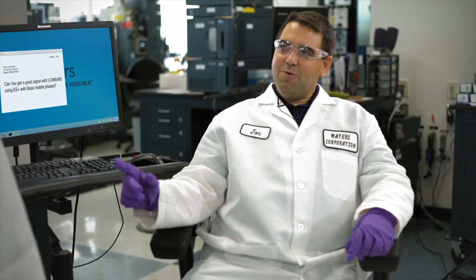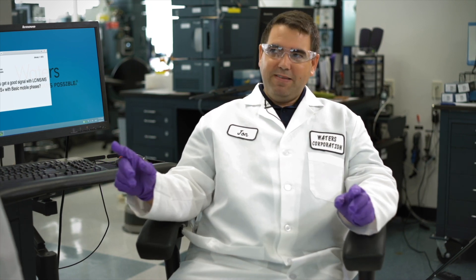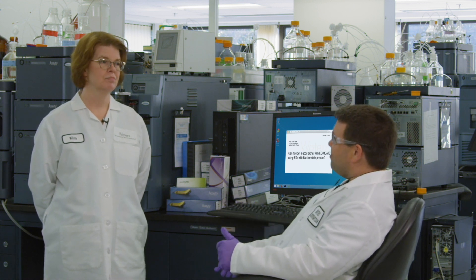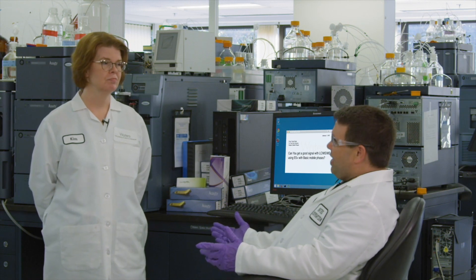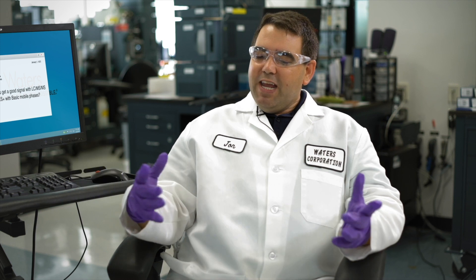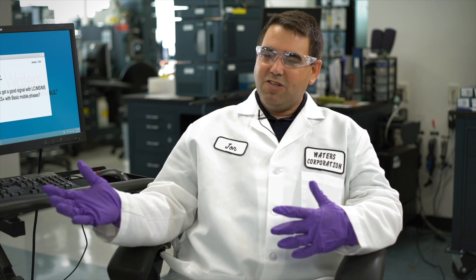Based on the experiments we ran with basic analytes under both acidic and basic mobile phase conditions in electrospray positive mode, it's pretty convincing that you can get a really good signal — if not a better signal — when using a basic additive in your mobile phase. This myth is busted. A lot of people might not screen with the basic additive just because they may not have a column that can handle the alkaline mobile phase, but if you really want to screen your MS sensitivity, you should be screening under both acidic and basic conditions if possible.